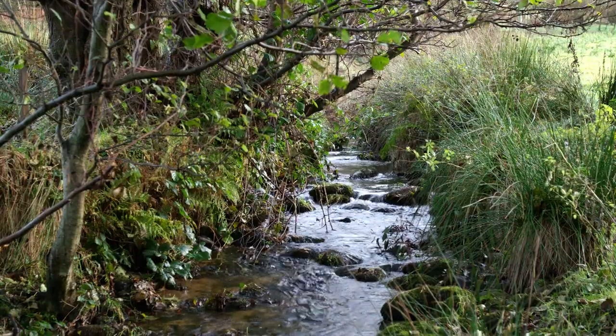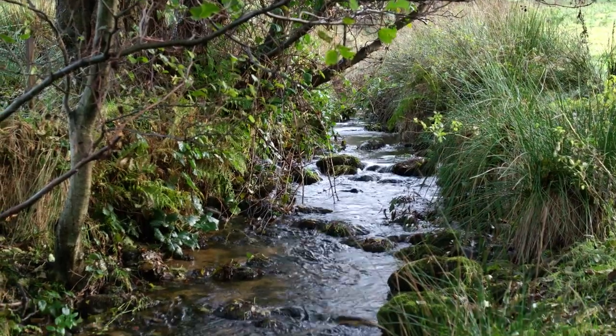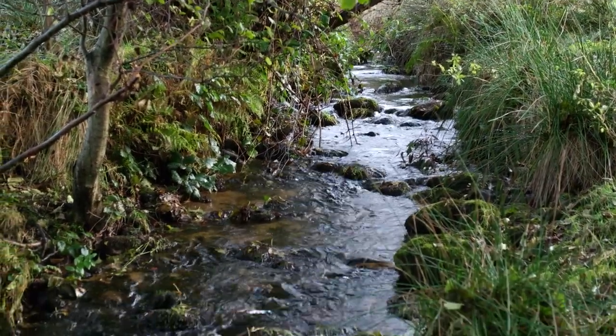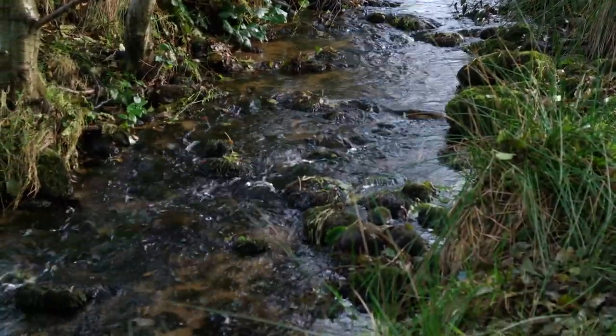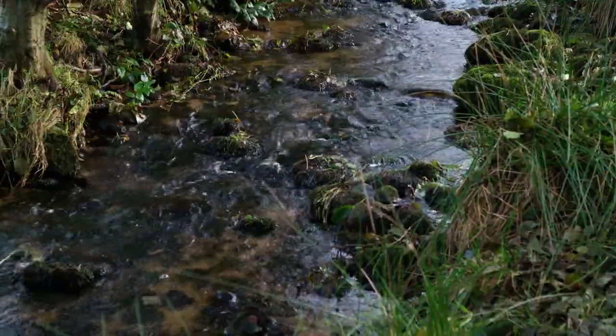Ensure you are facing upstream with the water flow coming towards you. If there is minimal flow in the stream, position yourself in the area with the best possible flow and avoid taking a sample from isolated ponds.